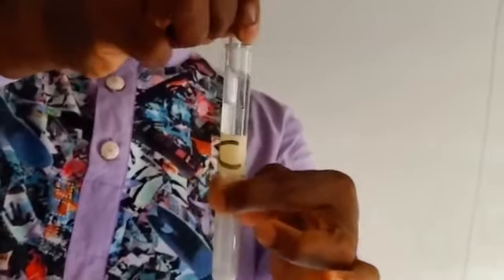When you have added water, look for a stirrer, like a glass rod, and stir the salt until it dissolves. So continue stirring. Then you can as well shake the test tube to facilitate the process, if your thumb is clean.